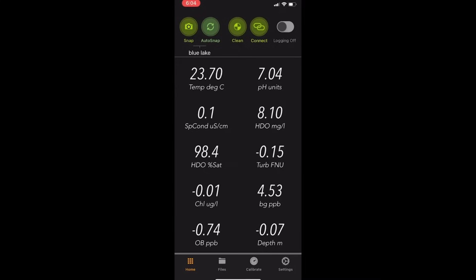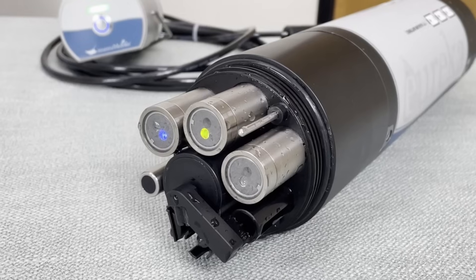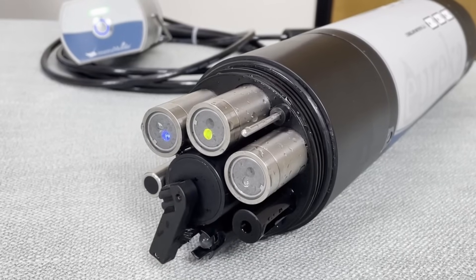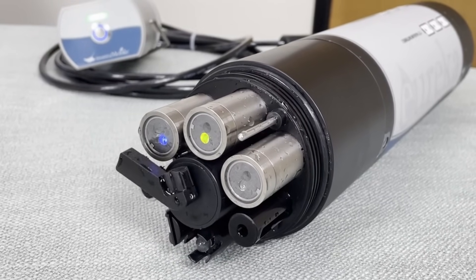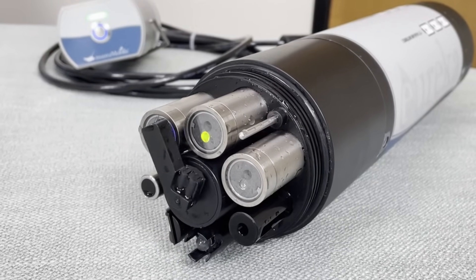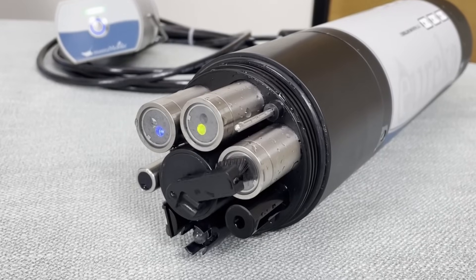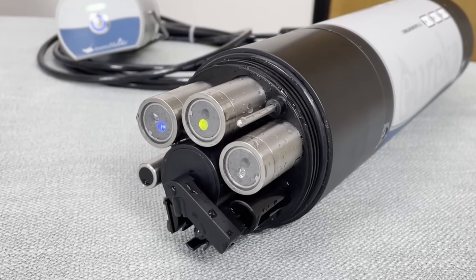The third hot button is clean. The clean function will run the wiper if you have a wiper installed on your Manta multi-probe. We tapped clean. I can see the wiper circulating on the turbidity sensor of this multi-probe. It does one 360 degree wipe.